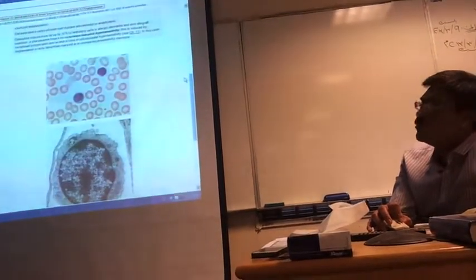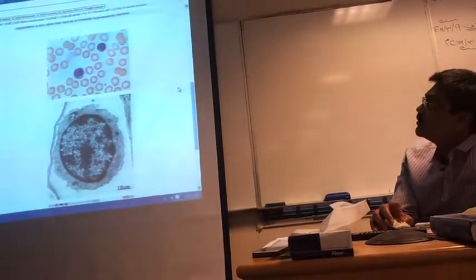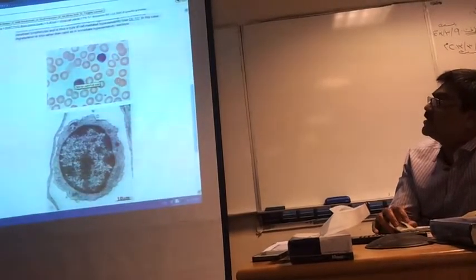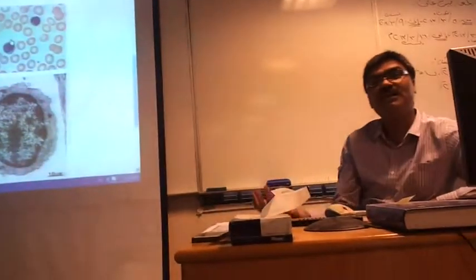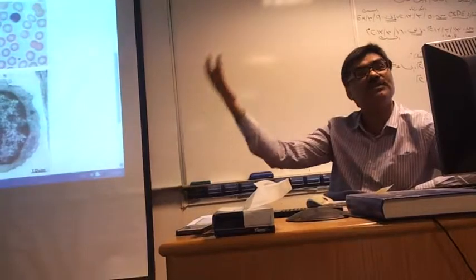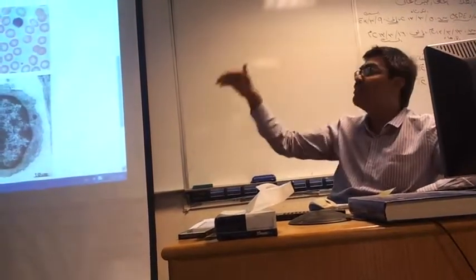This cell is a lymphocyte. What is the characteristic of lymphocyte? It is a rounded cell with an enormously big nucleus, and the cytoplasm is only present at the margins or periphery. This is the characteristic feature of lymphocyte. There are two types: T-lymphocytes and B-lymphocytes. You should know the function of each theoretically, as any question can come on this cell.